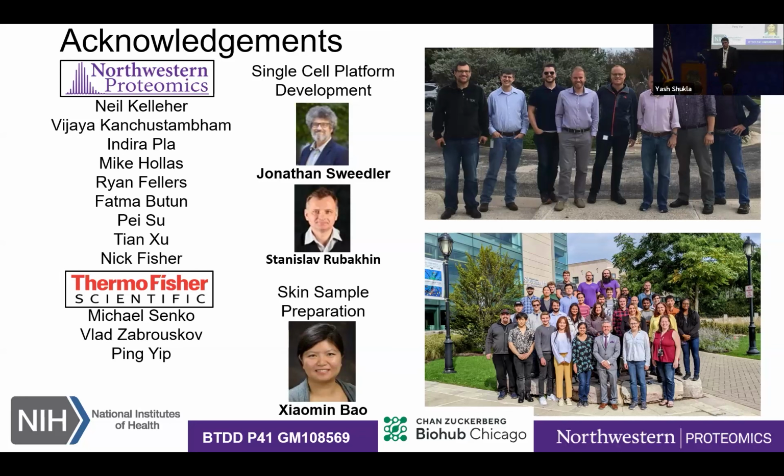Yeah, so that's a wonderful question. We've really started thinking about coupling, and I know other groups have done this too, single cell and then single nuclei based sampling to increase proteome coverage. Our depth is still not that deep. I mean, we're 265 proteoforms deep. We're not in the thousands. But yeah, we found that changing even the denaturing solvent, adding more acid, you can bias different histones and modifications. So there's a lot to explore there. We just haven't done it yet.